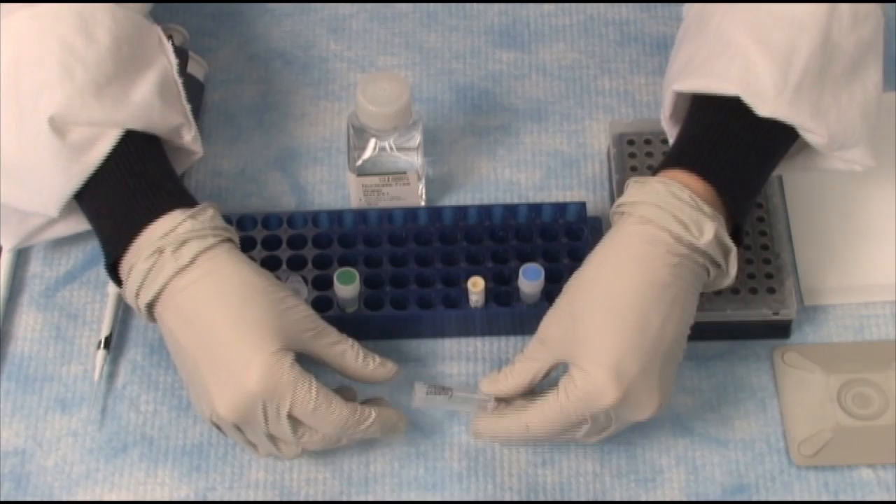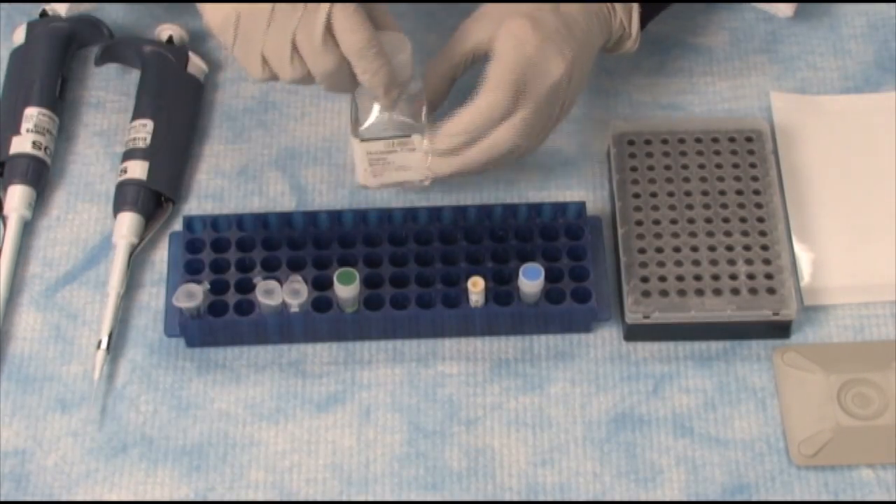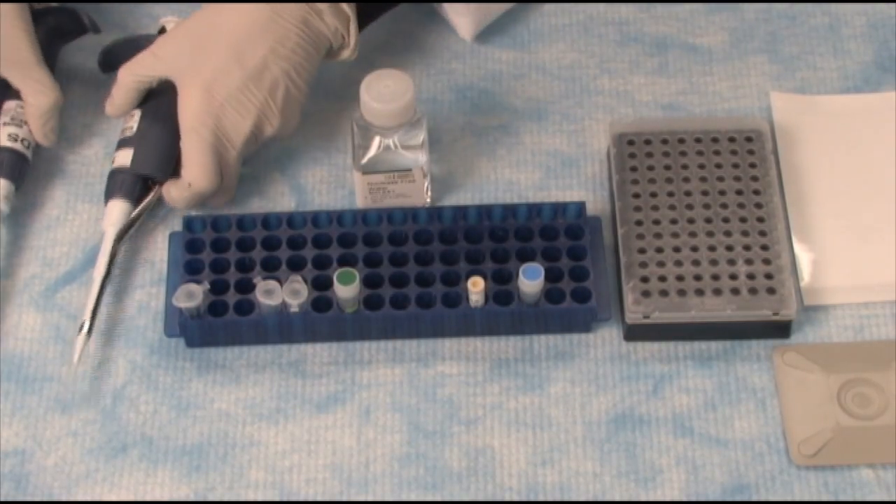Also, you'll require your cDNA sample, and finally, some water. These pipetmen are here to show you that you essentially pipet the reagents into the plate.